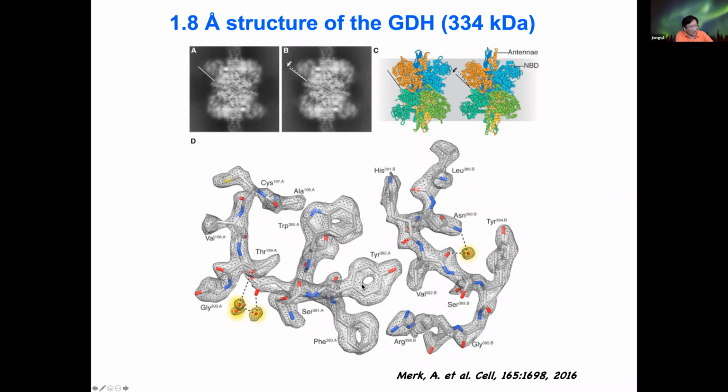In the bottom, as you can actually see, the electron density map really matches the atomic model, and the expected hole in the middle of the benzene ring is clearly visible in this side chain of the tyrosine residue.